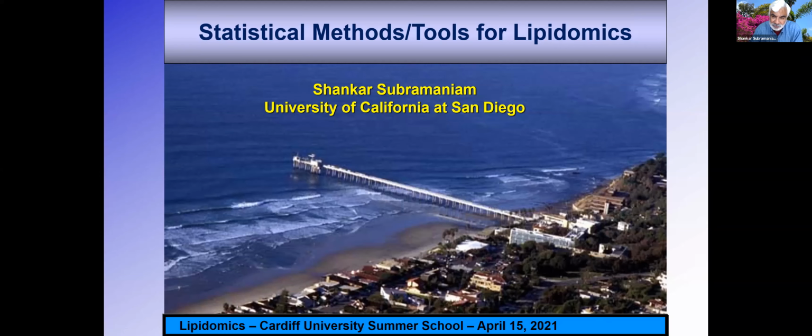Hello, everyone. I'm sure in the last 3 days you have been immersed in the world of lipids, and I'm going to continue the theme of lipids by telling you about how to process and analyze the data, and I'm going to suggest some very interesting tools for analysis of lipidomics data.